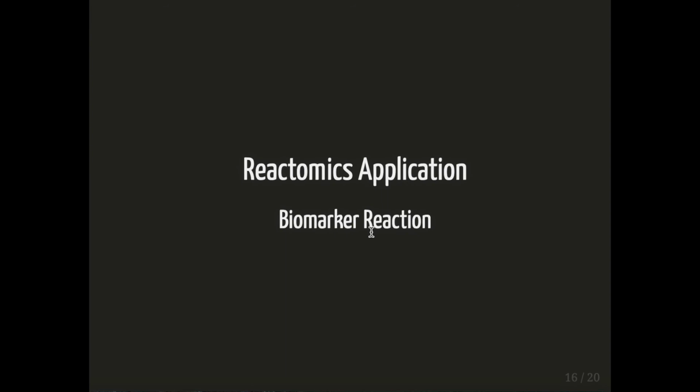So the third application is more about medical research. In most cases, when our collaborators talk about metabolomics, they're always thinking, oh, I want some biomarker. When they say biomarker, it means biomarker compounds. But in reactomics, we think the biomarker could not only be a compound, but also be reactions or specific PMDs within the data.